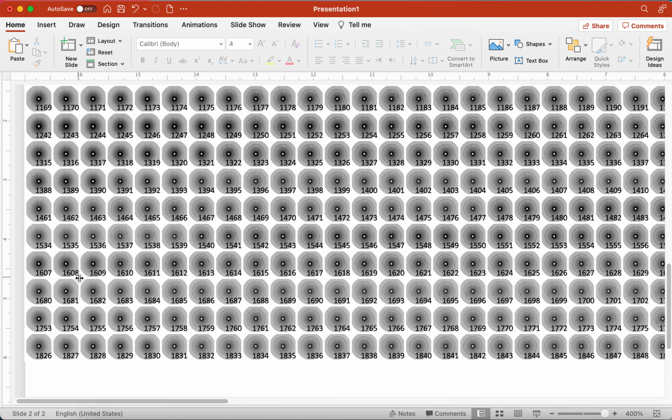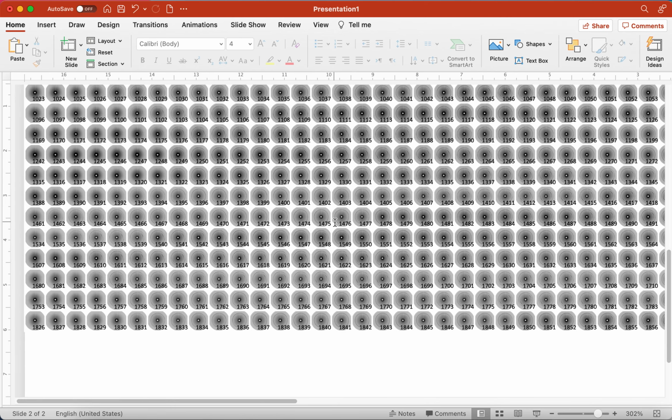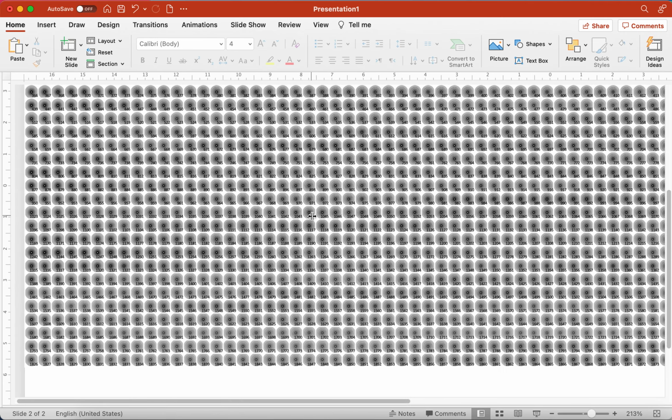So if we go to the edge here, you can see that diffraction pattern number 1534 is air. 1535 is also air, and then the crystalline substance starts at file number 1536. This is a very nice way of identifying the data within our composite map.